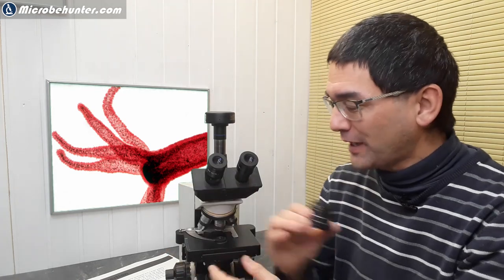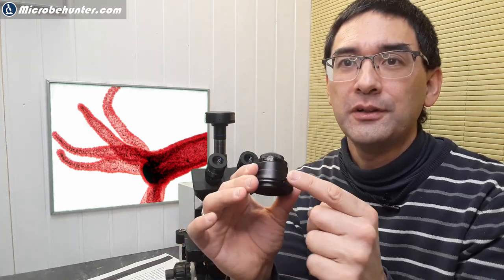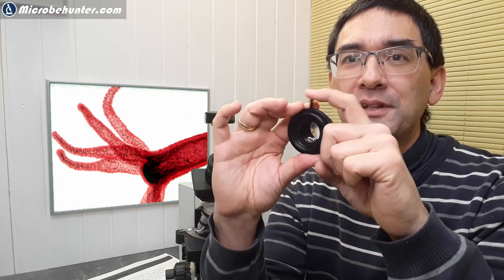Hi, Microbe Hunter here. This here is a condenser of a microscope. The condenser can be found beneath the stage, and there is a small lever here which opens and closes the condenser aperture diaphragm.